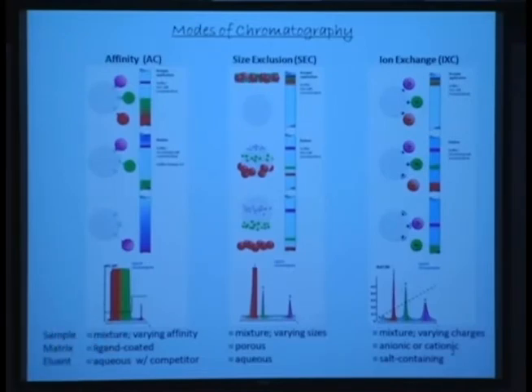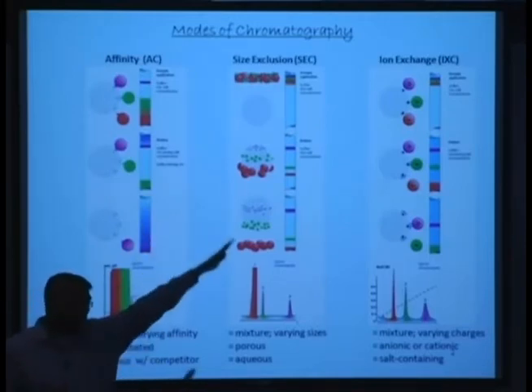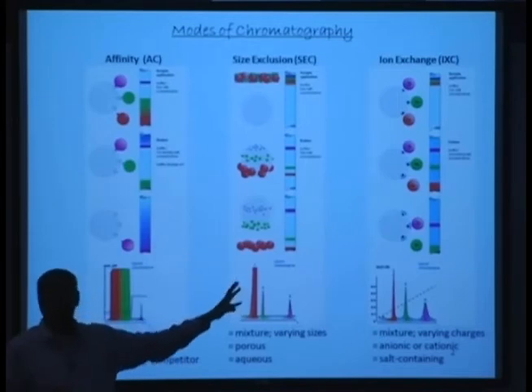Very similar here. If you are doing molecular weight determination of low molecular weight heparins, I think I have a slide that's coming up pretty soon. And low molecular weight heparins are heavily charged molecules. And we try to use controls that are based on dextran, unsulfated dextran.